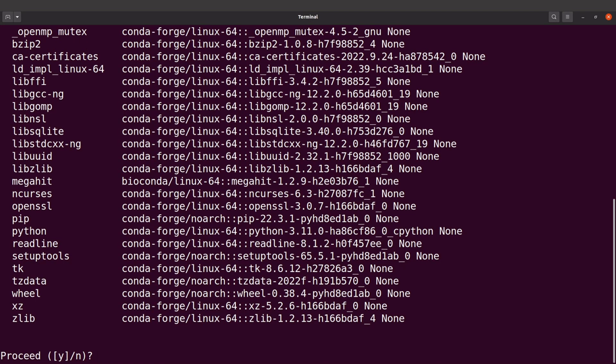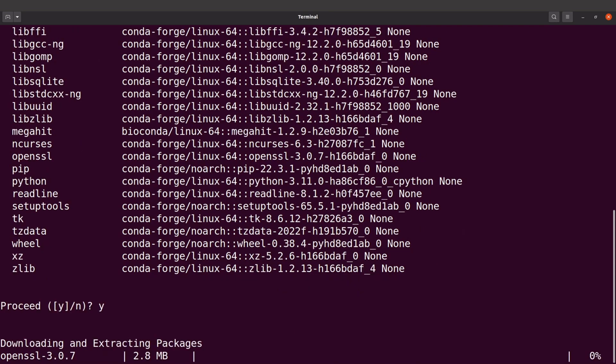Conda will download the packages and then install them for us.